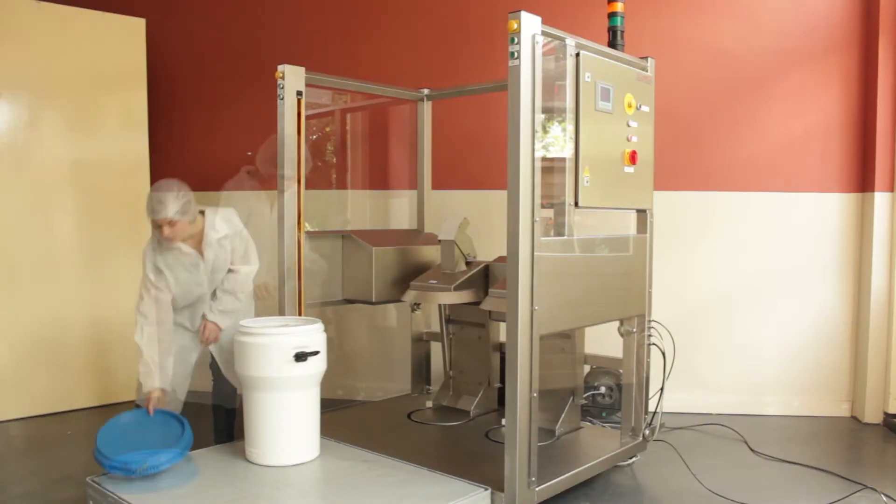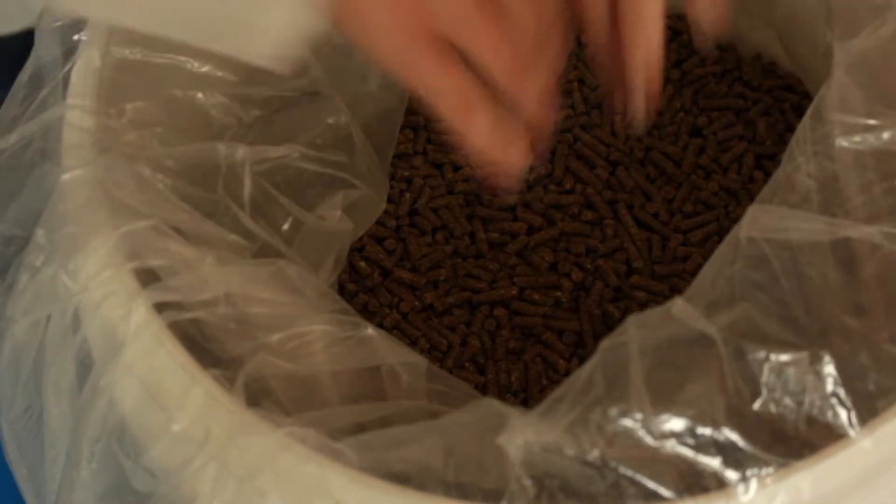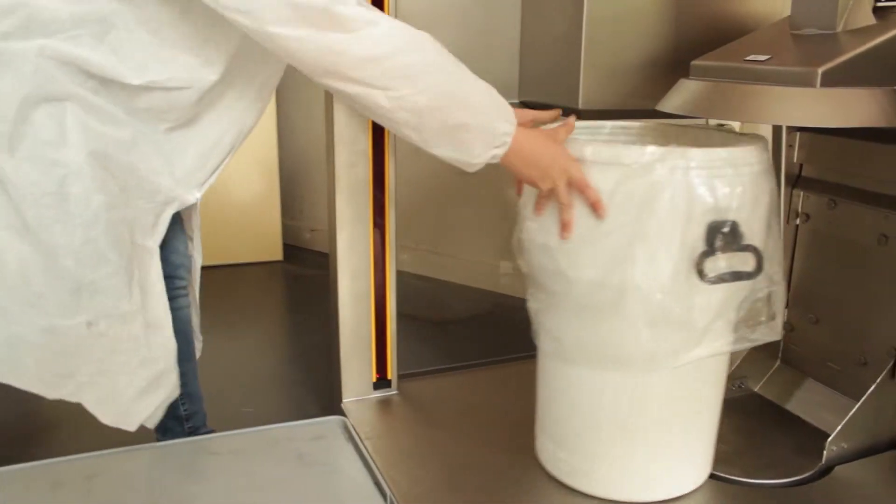Place a pallet with closed drums in front of the tipper, prepare a drum and slide it onto the tipper.